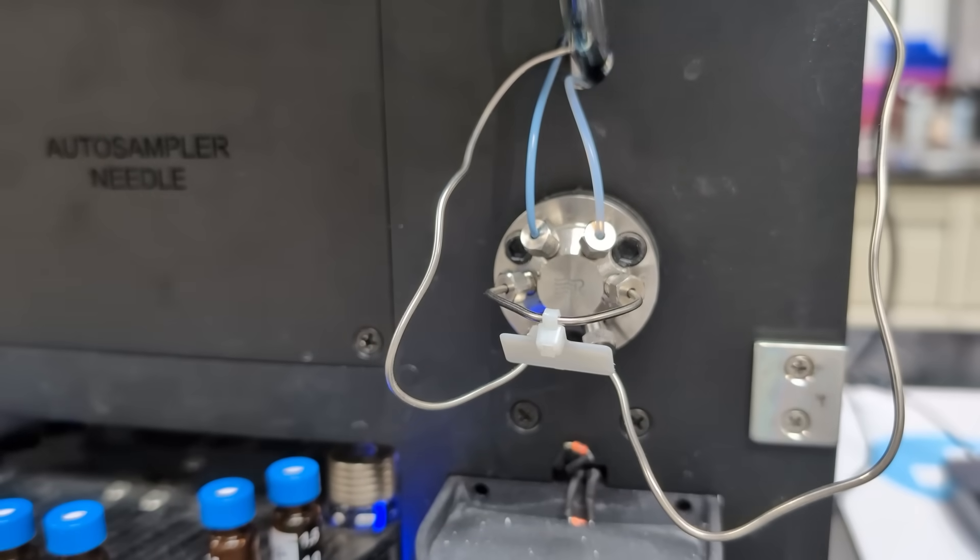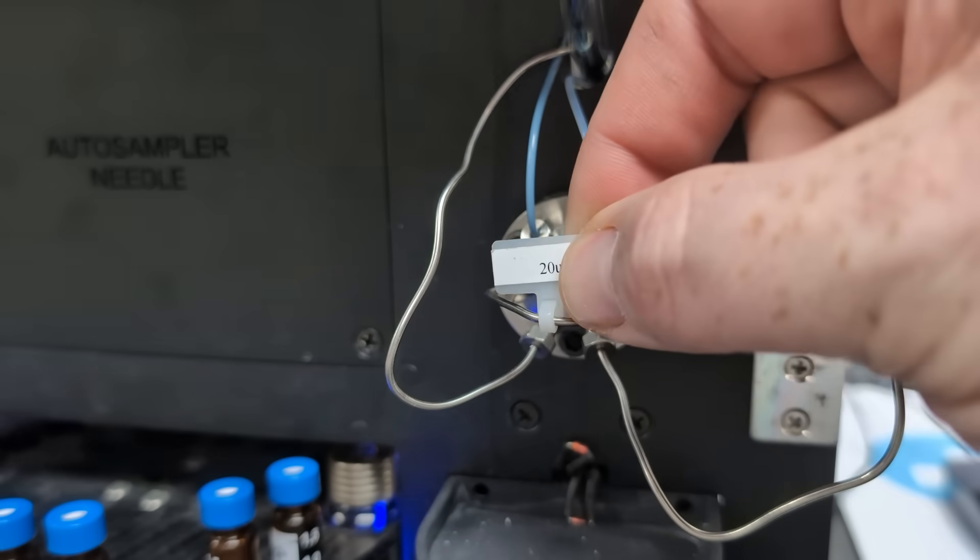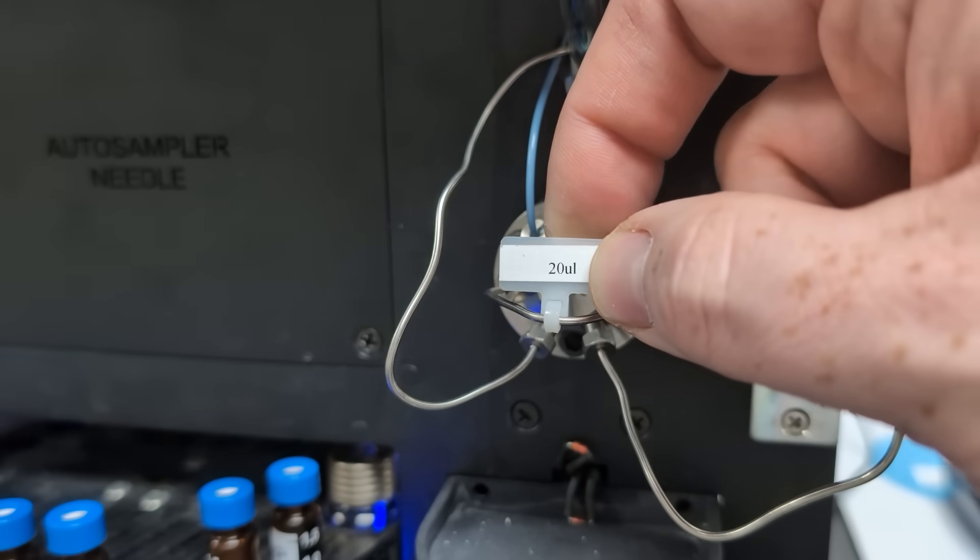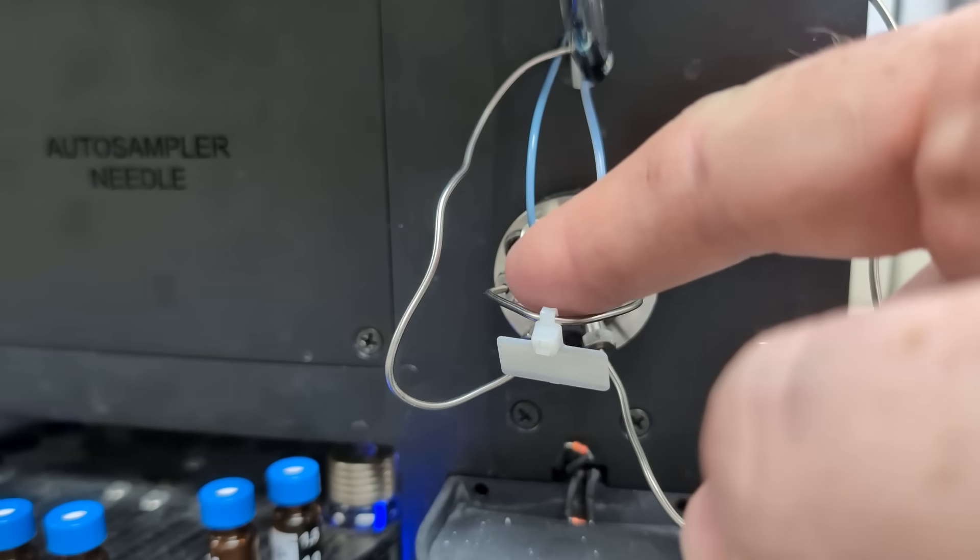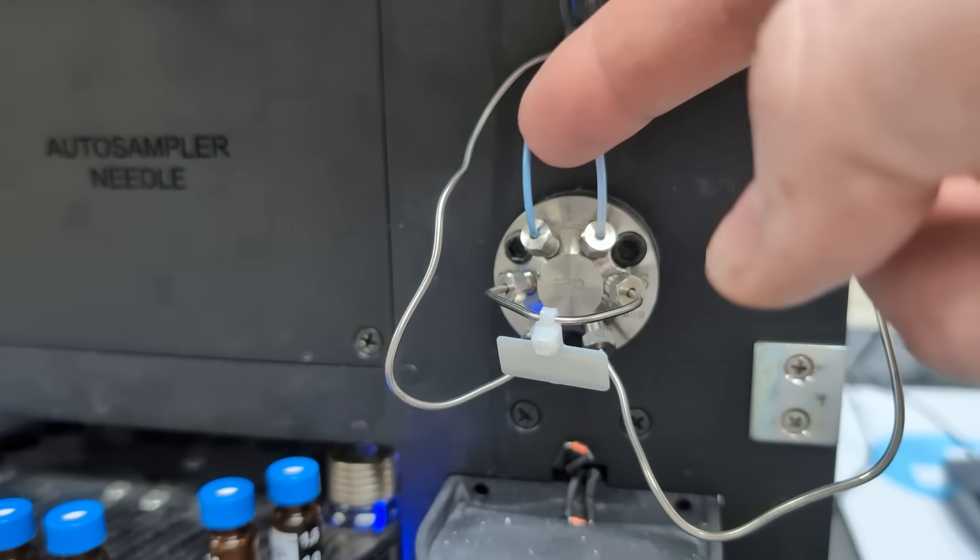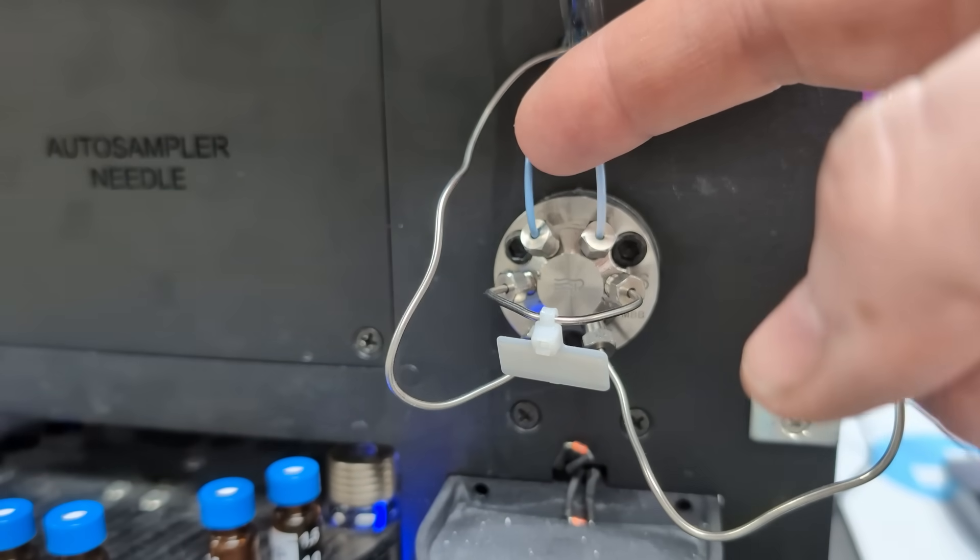Here we have an example of a pull-to-fill system on the Lucidity LC-UV. Here's our sample loop, and it's a 20 microliter loop, so that's usually denoted on the loop itself.